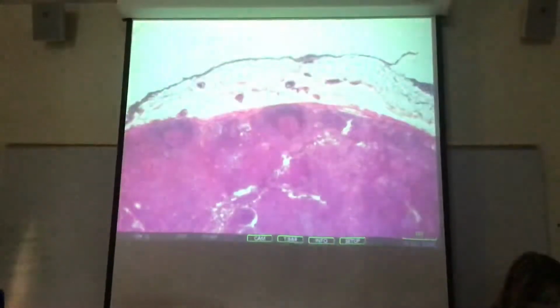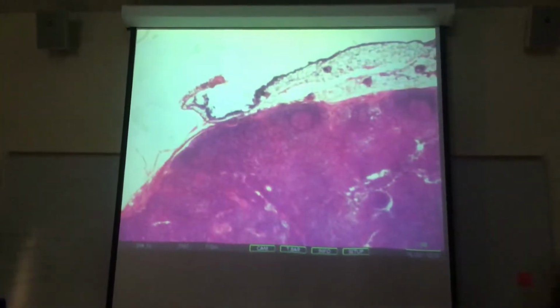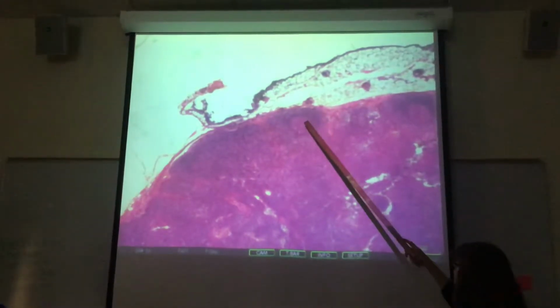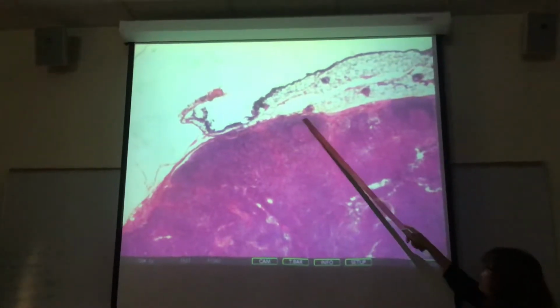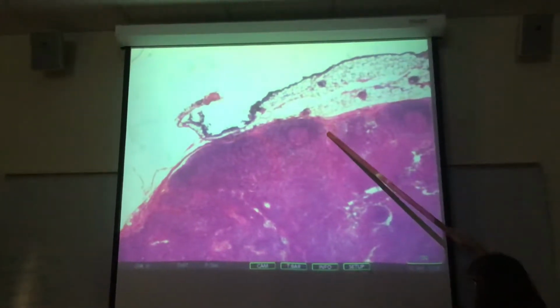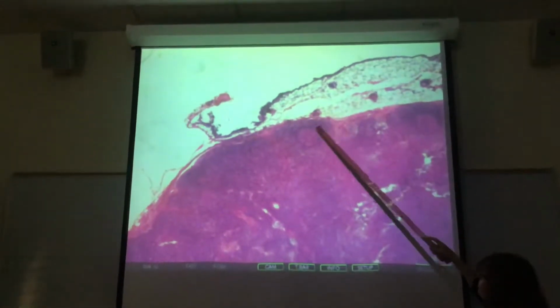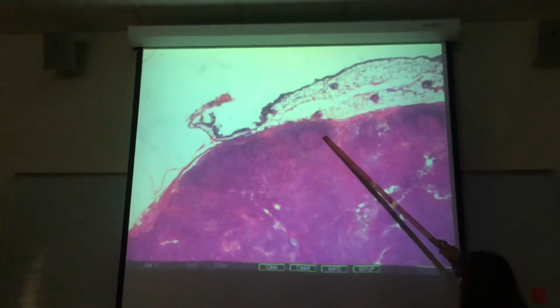So what I'm looking at right now is a slide of the lymph node in low power. Notice right away in low power, I see a little piece of a lymphatic vessel probably over here. But notice that I can see beautifully here the germinal center that stains lighter. And then remember, we call this whole thing a nodule. I also see the capsule here along the inside, and it invaginates to form these structures that we call trabeculae, but you all don't need to know that, I'm just telling you. So here we see the germinal center, and here's the whole nodule.